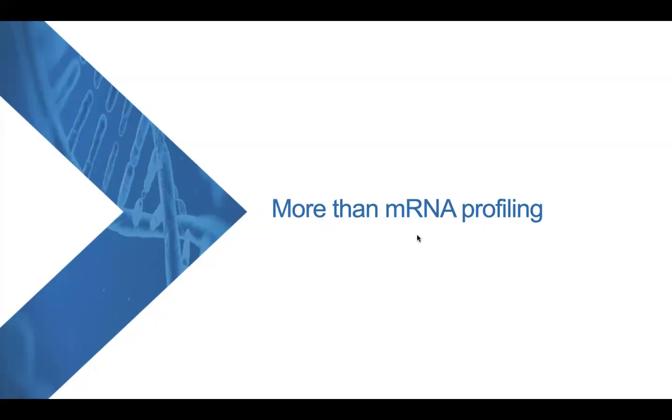The question is whether the technology can also be used for plant cells. The answer is yes. We have materials on our website showing you what we can do with the plant cells.